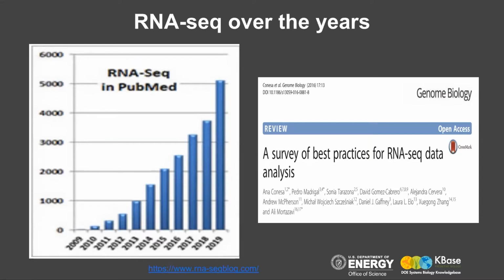Now RNA-Seq methods are available for studying many different aspects of RNA biology, including single cell gene expression, translation, RNA structure, and even spatial transcriptomics. So it is evolving quite fast. I found that the RNA-Seq blog is quite useful for the latest innovations in this field. And although RNA-Seq is widely employed, this rapidly advancing transcriptomic technique can be quite overwhelming.